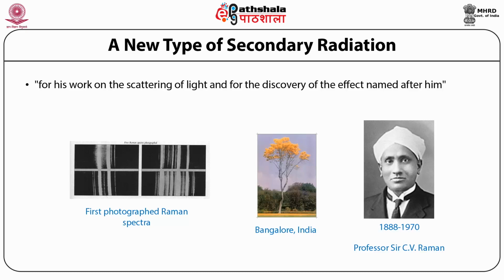This was because of the inaccessibility of intense monochromatic light sources and the absence of reasonable optical parts and detectors. With the discovery of lasers in 1960 and the advancement of high-throughput monochromators and sensitive detectors, Raman spectroscopy has been progressively applied to solve problems of both technological and fundamental interest.